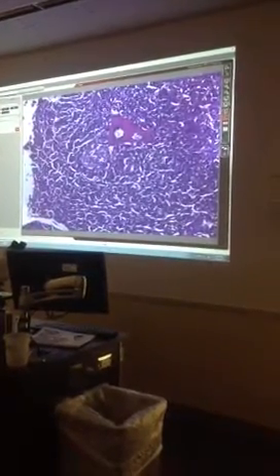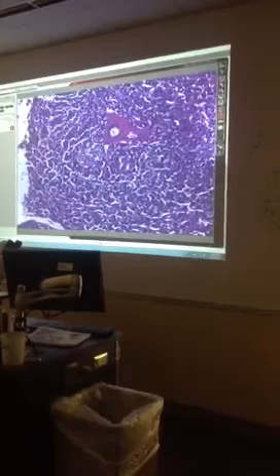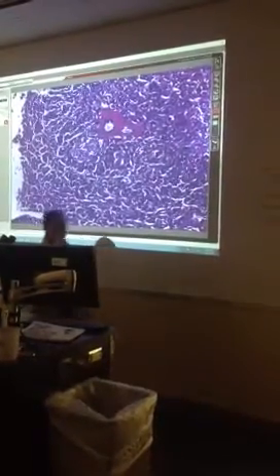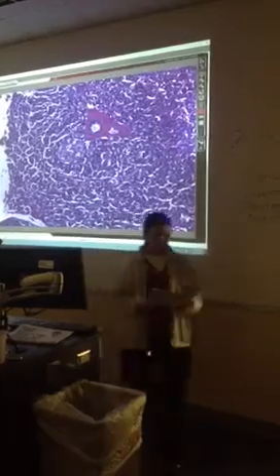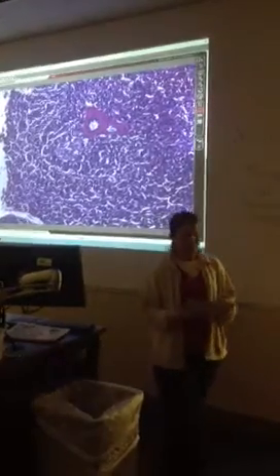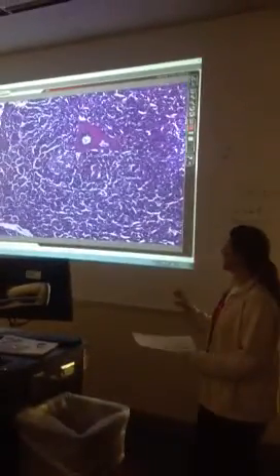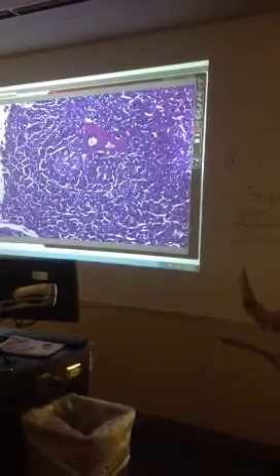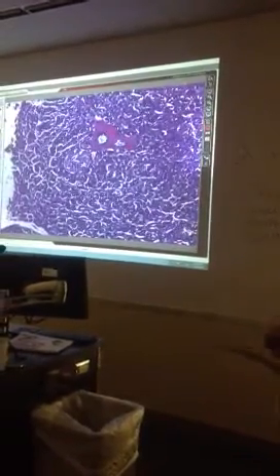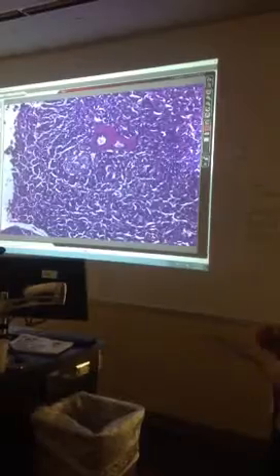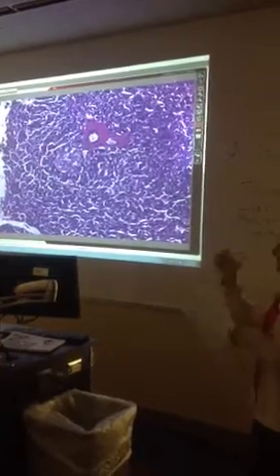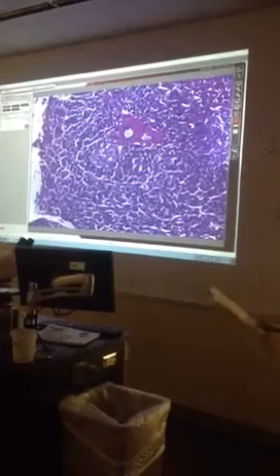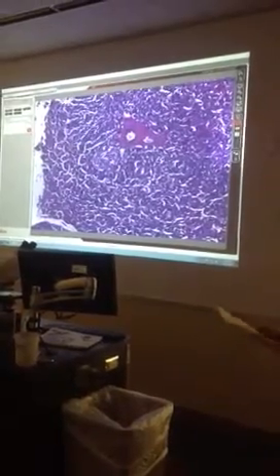The first one is the pancreatic acini. We've heard the word acini before with our salivary glands. For the pancreatic acini, these are cells that are mostly all over the place — they're kind of all spread out. They form small clusters because they have space between them. There's some white space you can see on the screen between them, but they're all over the place.